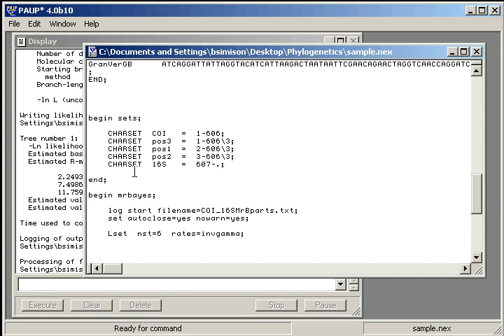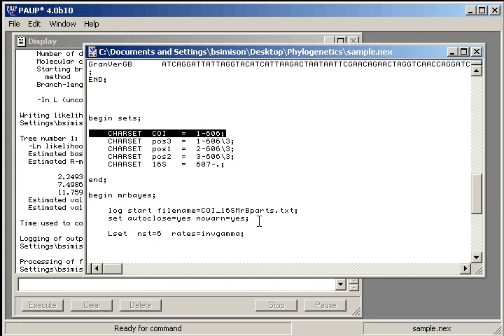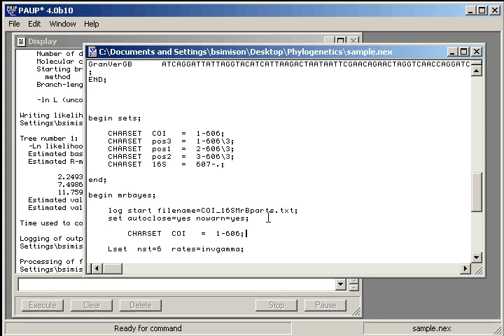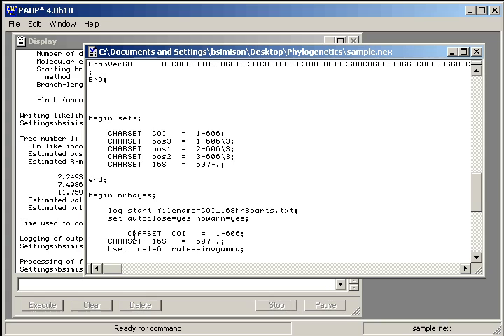And now let's create our character sets. In this case, let's just do CO1 and 16S. There's our CO1 and our 16S. I like to make them pretty.